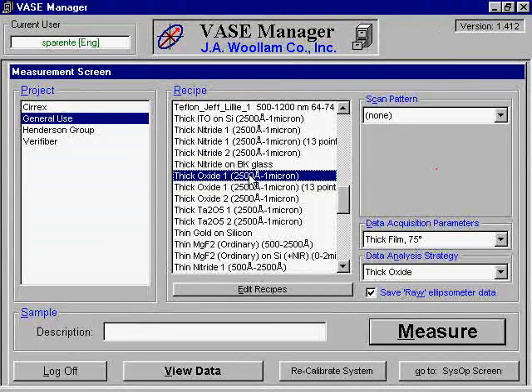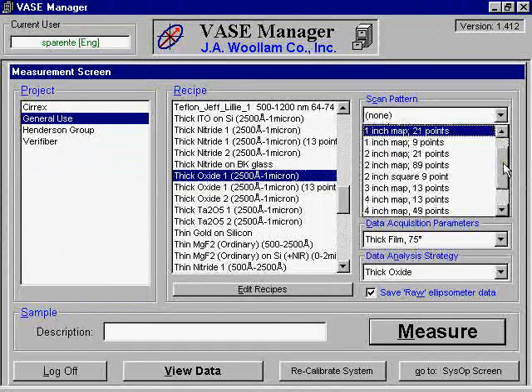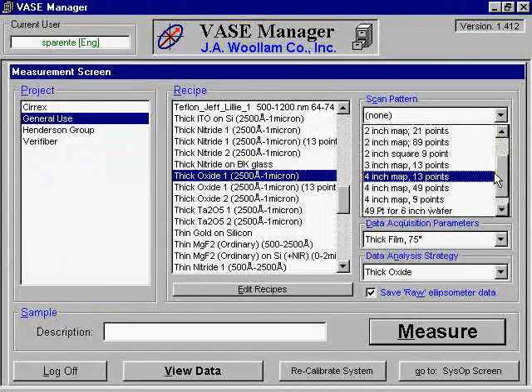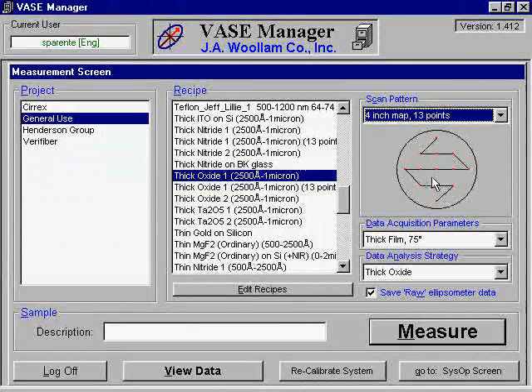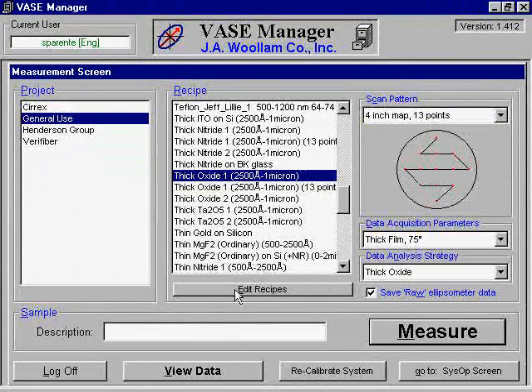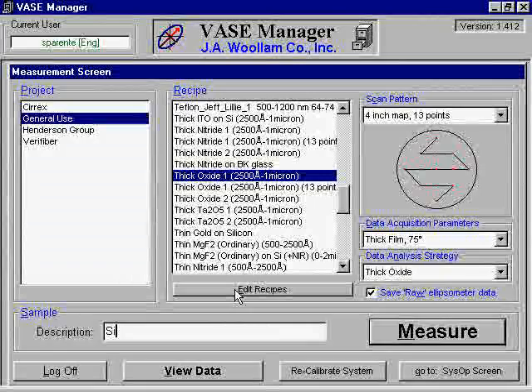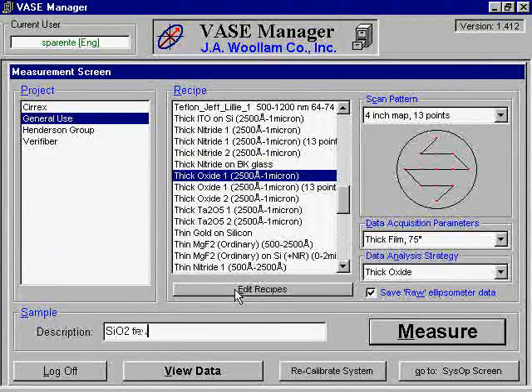The Woolen ellipsometer is capable of automatically performing scans at several designated points along the wafer. For the scan pattern, select the diameter and the number of points you wish to scan. For a single point scan, select none. For the sample description, you should enter an appropriate description of your sample, which will allow you to find it later when you wish to review the results. Once the appropriate information has been supplied, click Measure to continue.